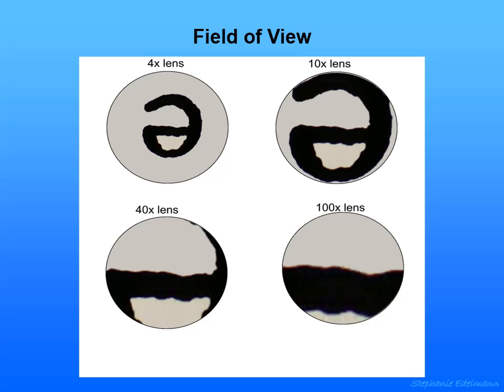That's because your field of view is limited by the size of your objective, by the size of the openings that you have to work with. And so with each magnification, you see more detail in the image, you see the item bigger, but you see less of the overall image, which makes sense because as you're zooming in, you'll see less and less. Otherwise, you'd have to make a bigger picture.